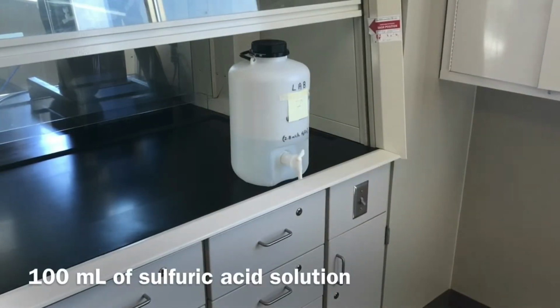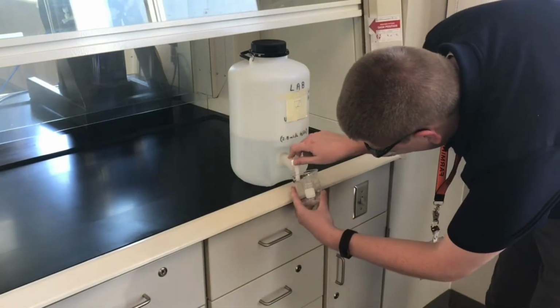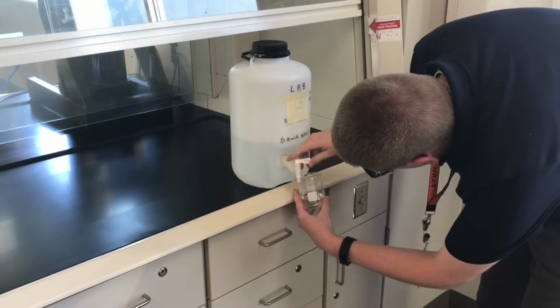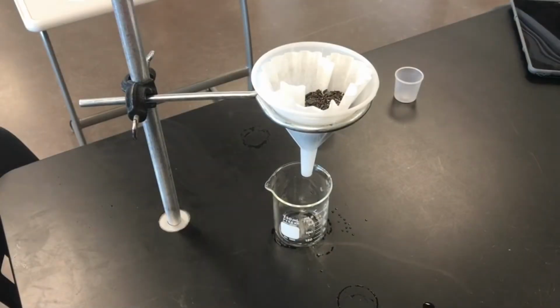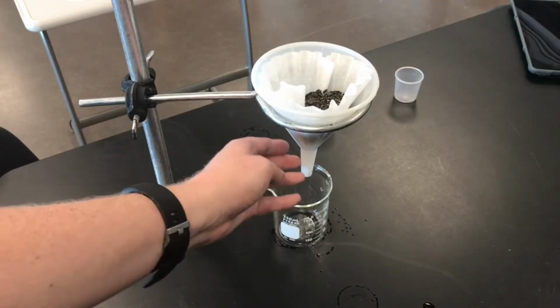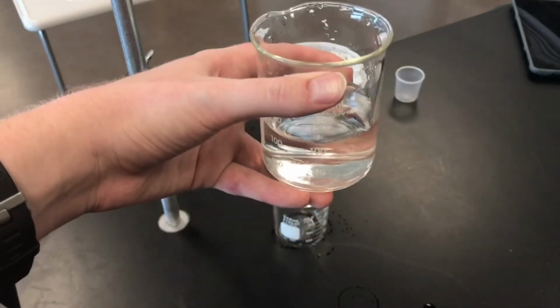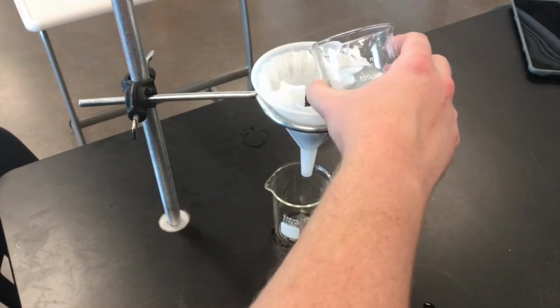All right, I'm going to grab another 100 milliliters of our sulfuric acid solution. All right, everything seems to be in order here. I've got my soil B in my coffee filter. I've got a beaker under the funnel here to catch all of that excess sulfuric acid solution. I've got my sulfuric acid, 100 milliliters. And so I'm going to pour through, just like part one, I'm going to pour through 3 times.